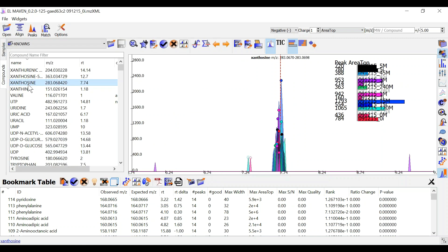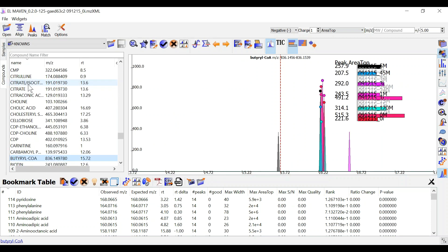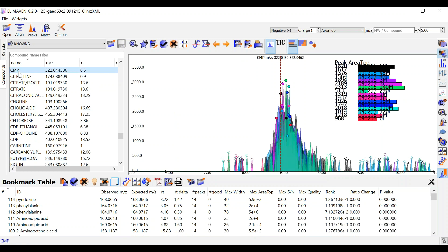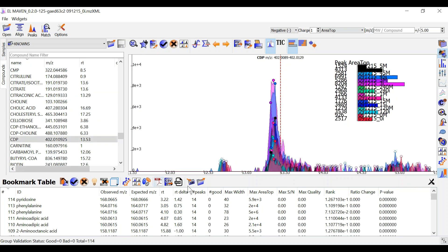Go through each of these metabolites and keep marking your samples as good or bad. You can also use keyboard shortcuts G and B for marking your peaks as good and bad respectively.